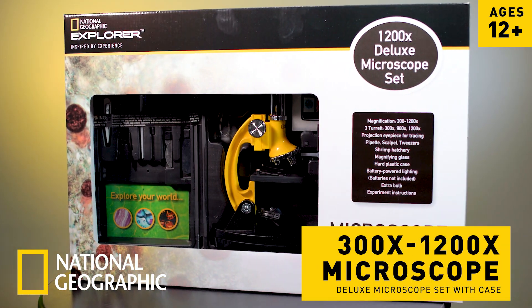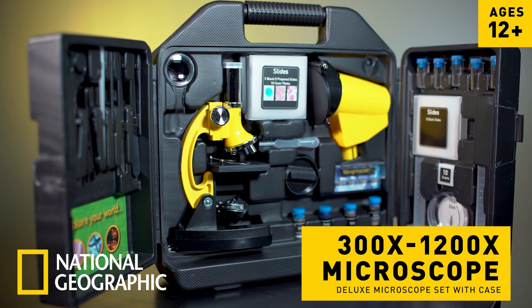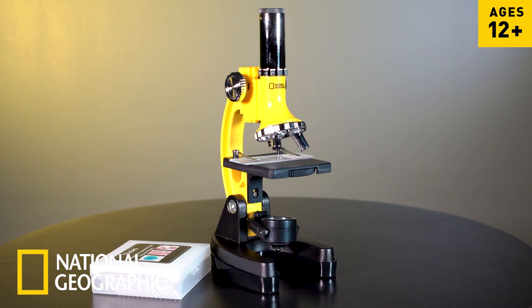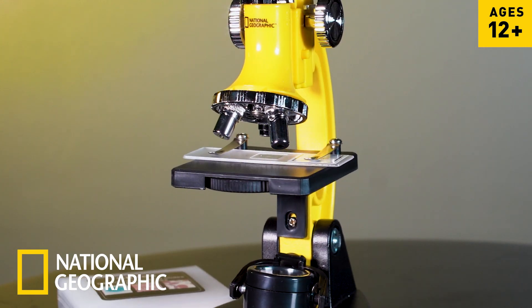The National Geographic 300 by 1200 microscope ignites curiosity and encourages exploration of the world around you. The traditional compound microscope delves into hidden details of unusual specimens and reveals surprising dimensions of the most common of subjects.